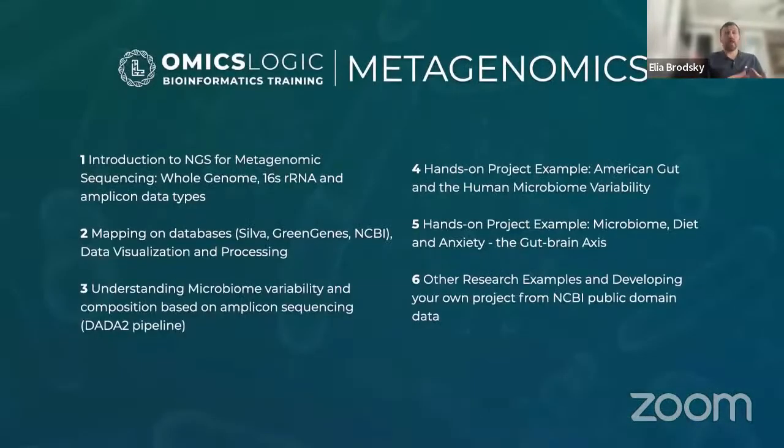Some of the sessions will be live, like today. Some of them will be pre-recorded. Today's session is live. You can ask us questions. You can comment. If you have any specific things that you expect from this program, we would love to know.